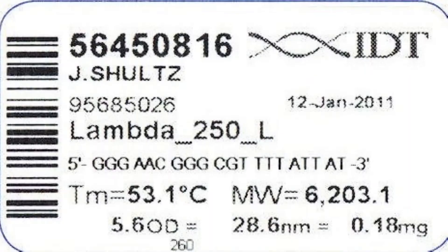Once you have ordered your PCR primers, they will be manufactured, then dried, or lyophilized, and shipped to you. These dried primers are very stable and can be stored for a very long time.